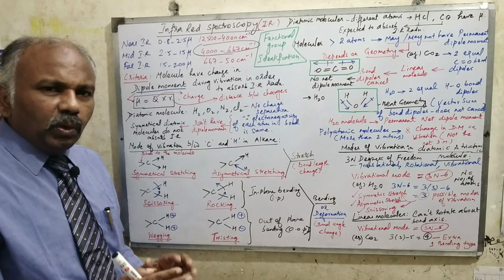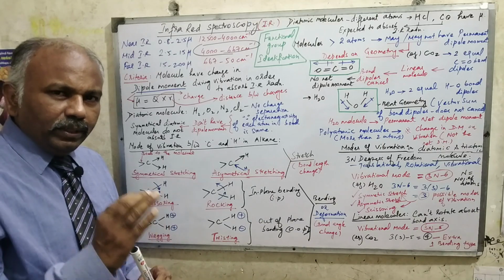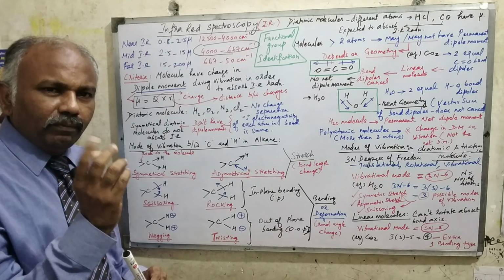Now, generally, as I told, there are different types of vibrations. We are going to discuss the basic vibrational pattern as well as the modes of bending vibrations, or the modes of vibrations, right?